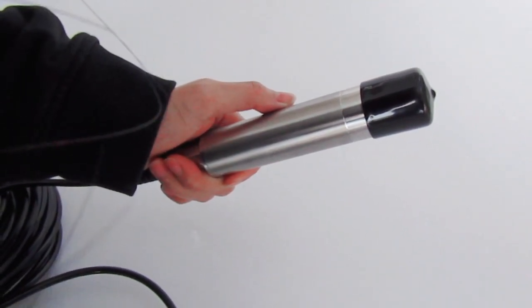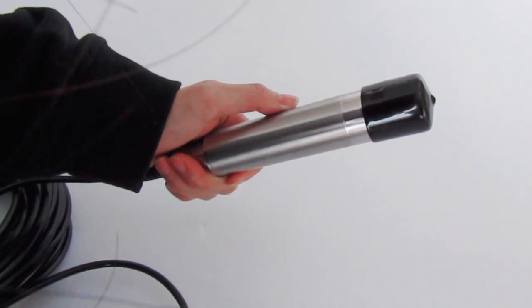Hello guys, greetings from Honda Tech. Today I will introduce our water DO and temperature 2-in-1 sensor.